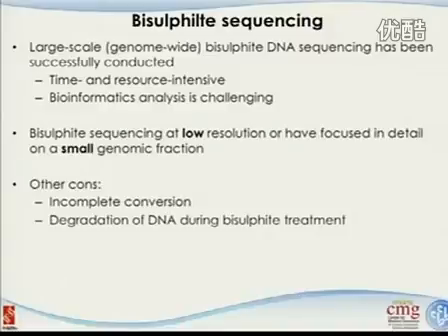So the good thing about that type of approach is you get away from this whole genome situation, right? If you think about a lot of repetitive regions, they are heavily methylated. I'm not interested in those regions. And if you design the restriction enzyme right, you should be able to get away from those regions. You can have better handling by only focusing on the regions you're interested in.